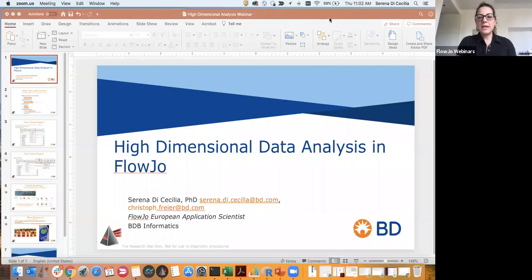Okay, so today it's going to be our third appointment for a webinar regarding the high dimensional data analysis in FlowJo, and we're going to talk about plugins. I hope you guys have been looking into plugins and what they are.